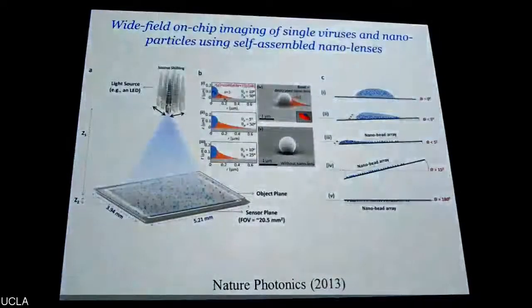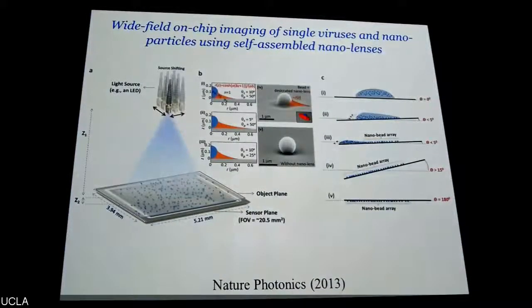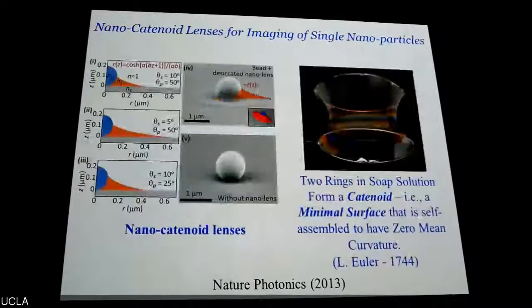modalities. So in the interest of time, I'll switch next to how you can use the same framework to look at tiny objects like viruses and nanoparticles. This is a very difficult problem. Trying to see a nanoparticle or a virus with these types of microscopes is analogous to trying to see the moon on a sunny day. It's very difficult. You will be seeing direct sunlight.